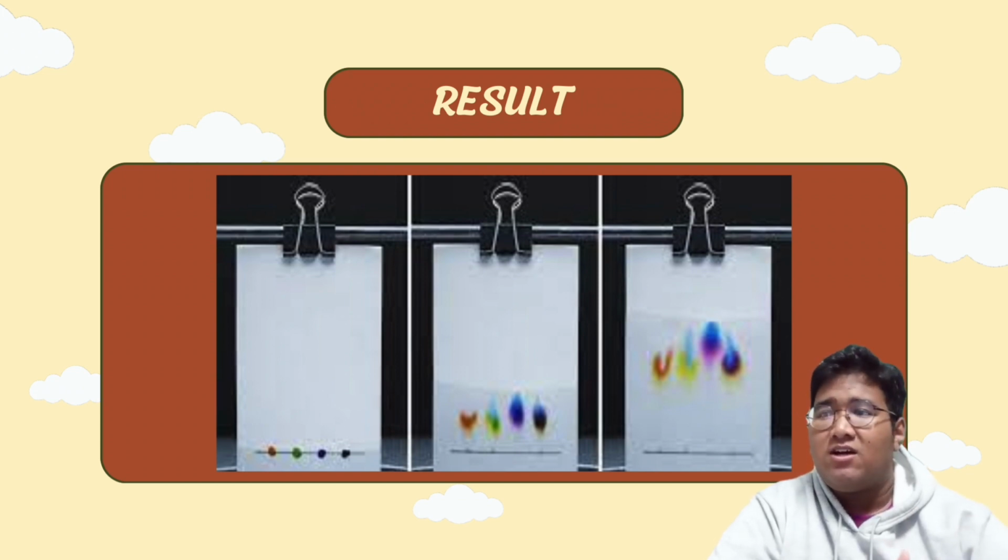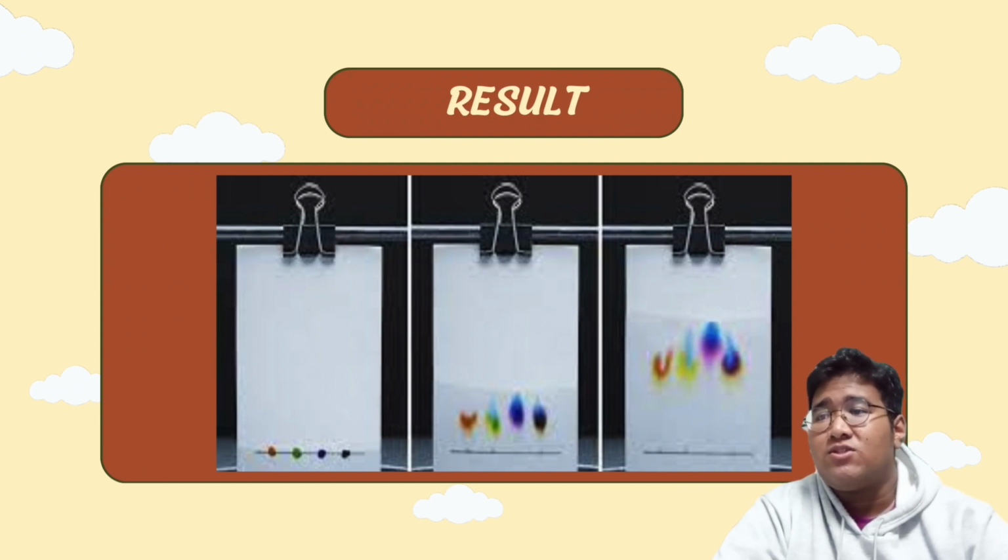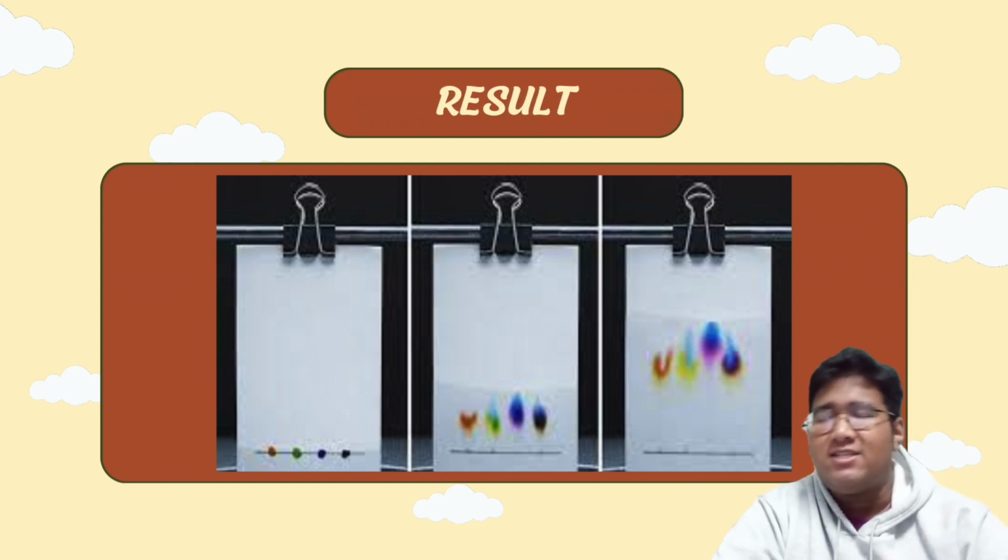With chromatography, a small amount of ink is applied to the paper. The ink is placed in water, and as the water works its way up the paper, the various colors of the ink are revealed. This is all possible because ink is water-based and made up of various components that have different solubility or densities.